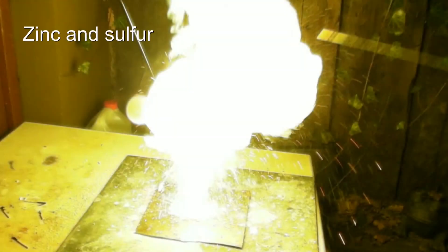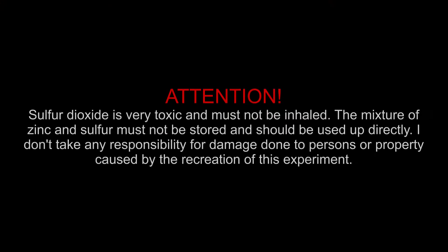Zinc and Sulfur — Attention! Sulfur dioxide is very toxic and must not be inhaled. The mixture of zinc and sulfur must not be stored and should be used up directly. I don't take any responsibility for damage done to persons or property caused by the recreation of this experiment.